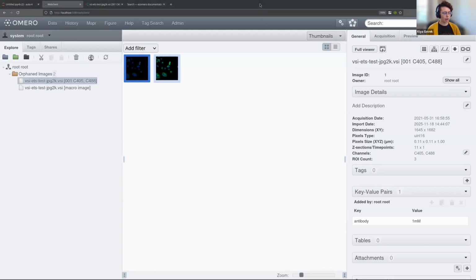So for our active OMERO, we run it inside the VPN, and our institute uses a worldwide VPN solution, such that I can connect to it from anywhere, and then I am essentially inside the Jax VPN and can only access OMERO that way. OMERO logins are controlled by our LDAP system, so authentication is handled by that, and it's a little bit more locked down that way.